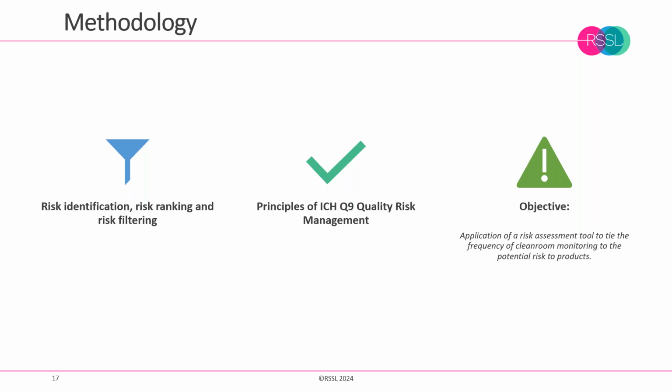So principally we have risk identification, the expression of the hazard, risk ranking, and risk filtering.